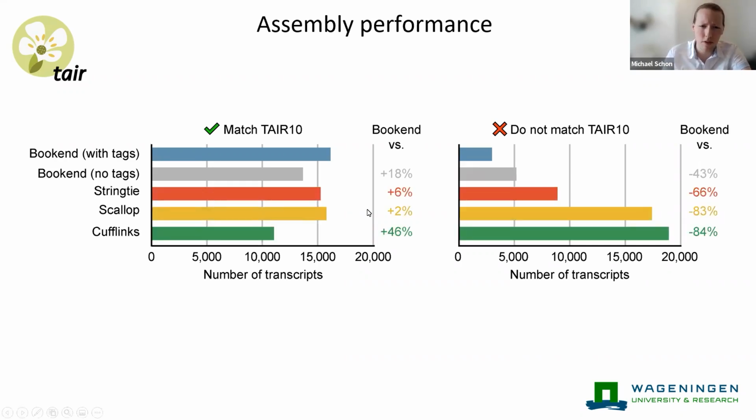And compared to existing transcript assemblers, we see that not only can more correct transcript isoforms be assembled, but that I am removing anywhere from two thirds to 84% of the artifacts that are produced by these traditional assemblers. So at first glance, it really does look like end information plays an extremely valuable role in transcript assembly.